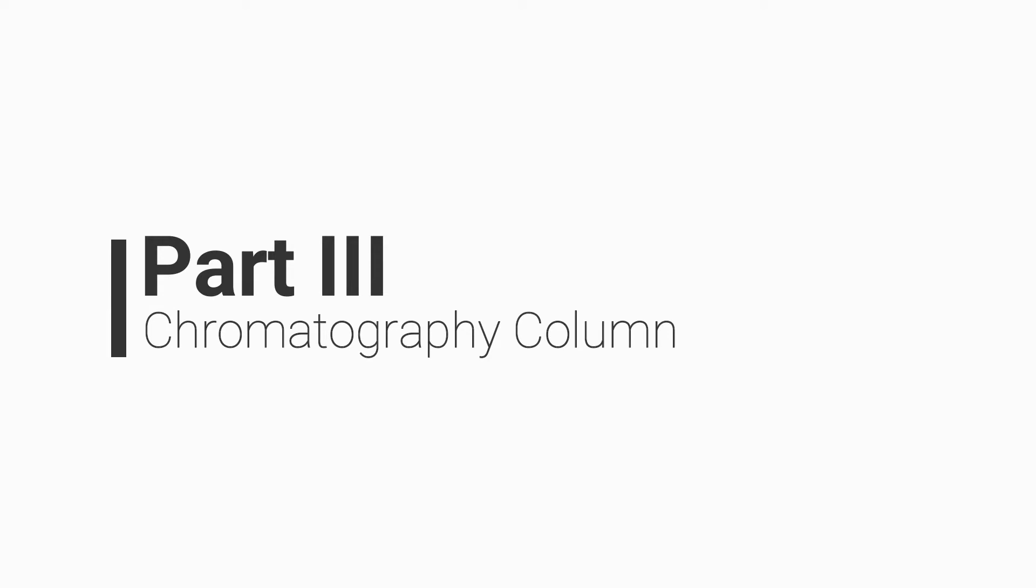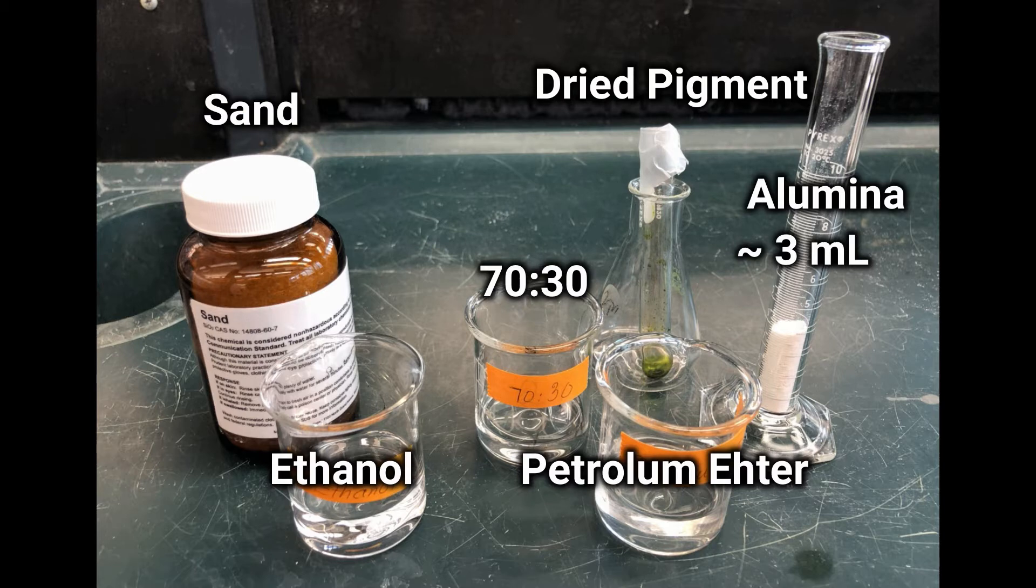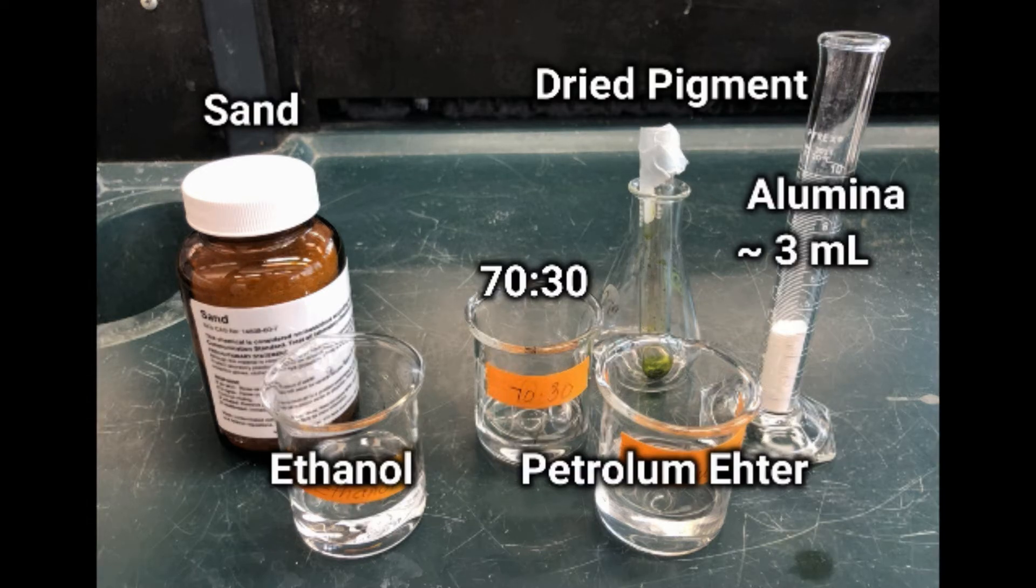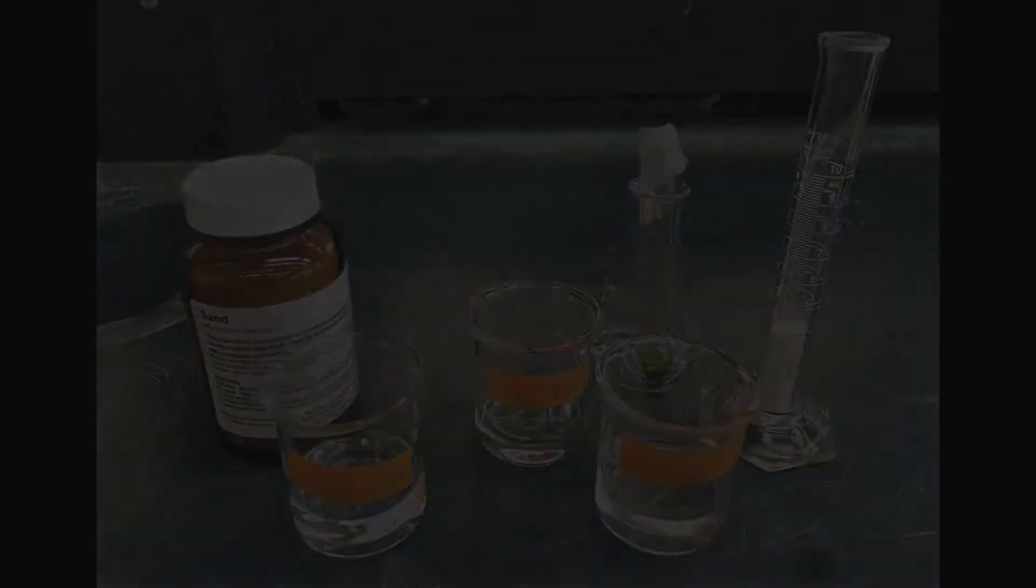In part 3, we will be separating the pigments using column chromatography. You will need sand, about 5 mL each of ethanol, petroleum ether, 70-30 petroleum ether, and about 3 mL alumina as well as the dried pigment from part 2.